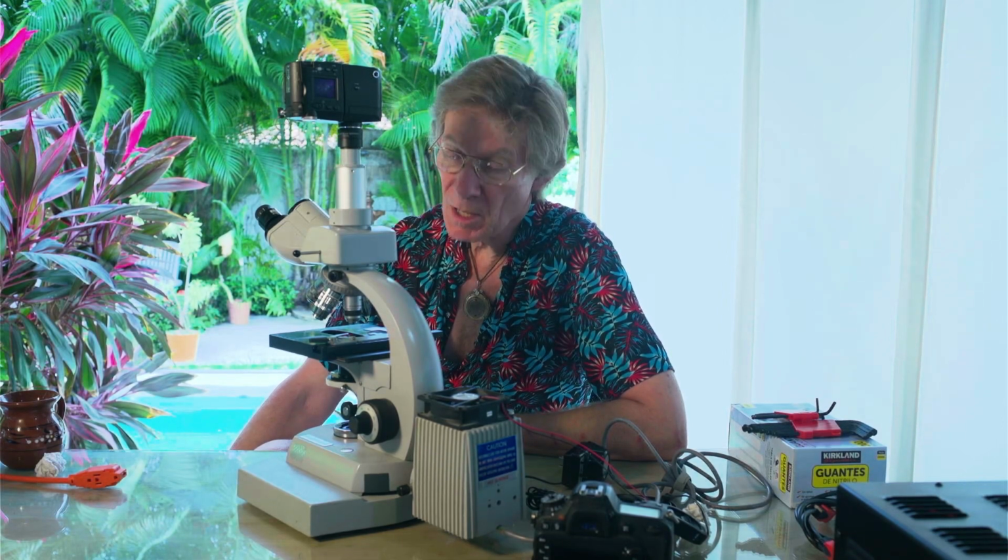Now, the reason I've used this camera for many years is it has a zoom capability built into it. So I can zoom in on what I'm looking at and have a much closer look. And that is an extremely valuable thing to have in the camera system, the zoom capability. So when I look for a camera, I want it to have a zoom ability, if at all possible. It's not absolutely necessary, but it's a very good feature to have.